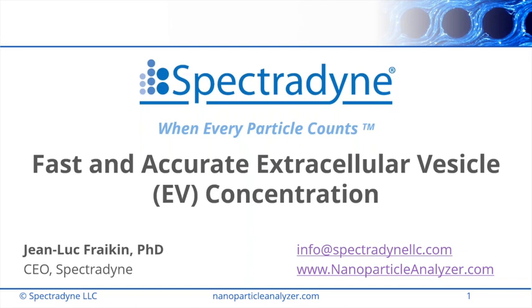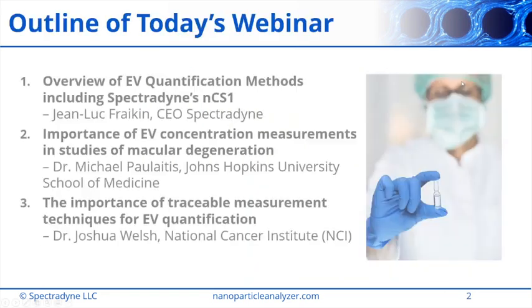Great, thank you, Nam. Hello, everyone, and thank you for attending our webinar today. I hope you'll enjoy listening to our guest speakers who will talk about the importance of careful EV concentration measurements in their own research. I will kick us off with an overview of EV quantification methods, including Spectradyne's own NCS1, and then turn the mic over to our two invited speakers, Dr. Paulaitis from Johns Hopkins University School of Medicine, and then Dr. Welsh from the National Cancer Institute.